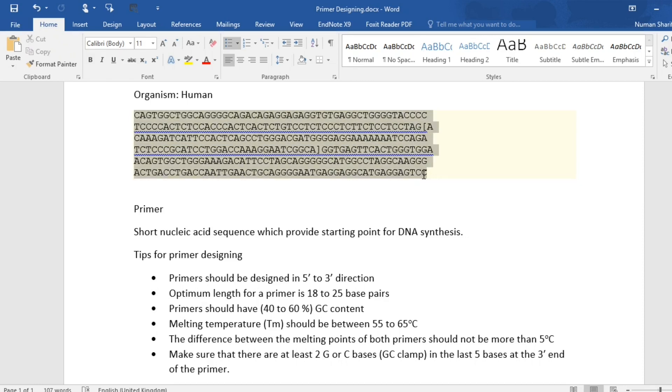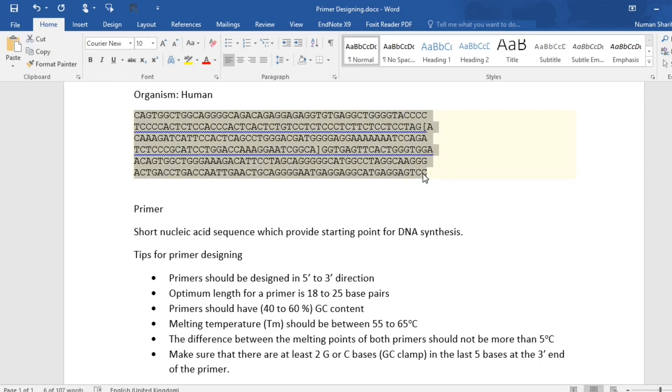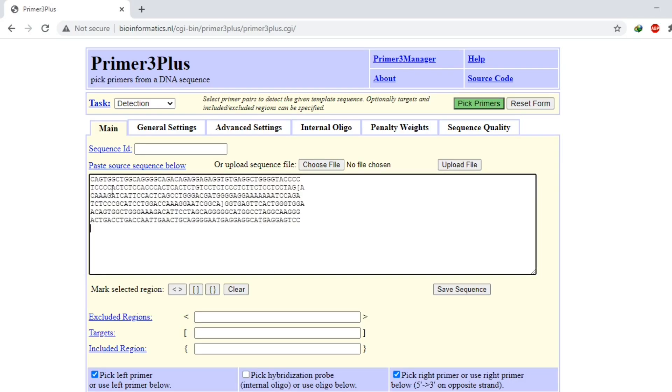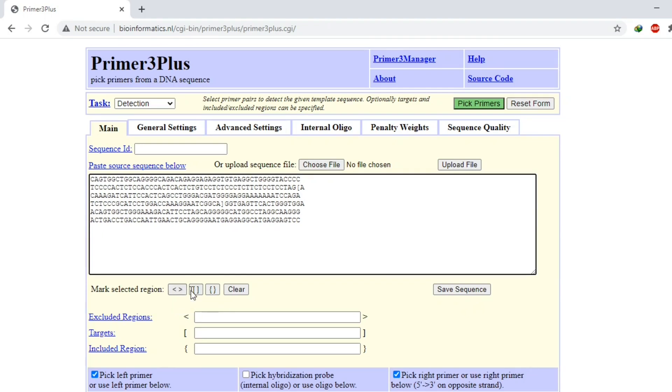So there are few options here. These symbols are used to exclude a region, these symbols are used for target region, and these curly brackets are used to include region.